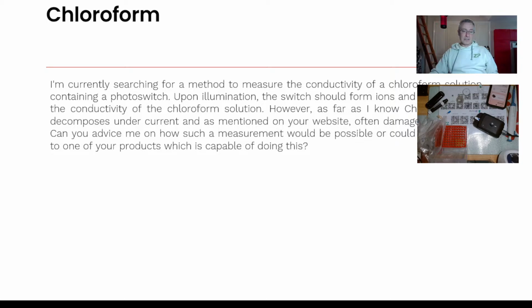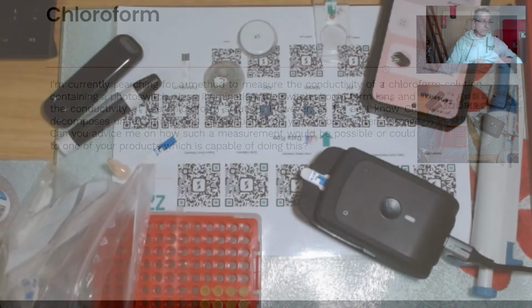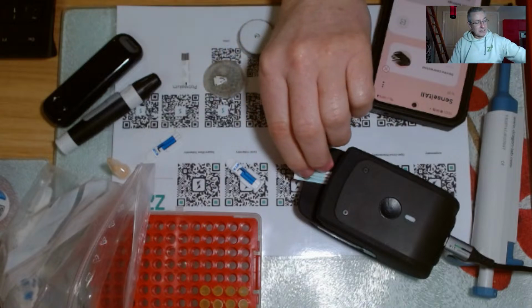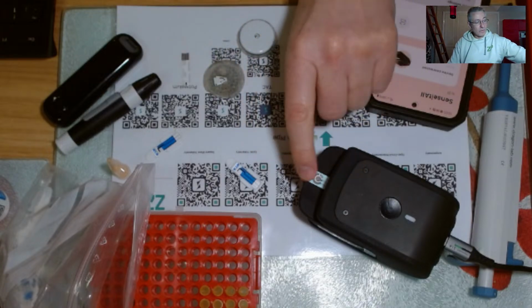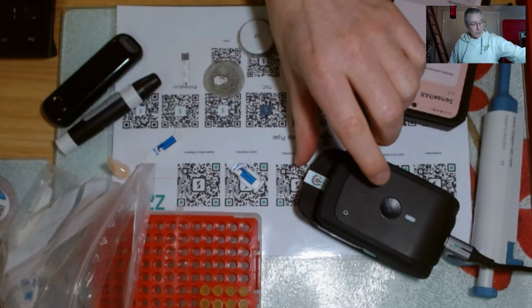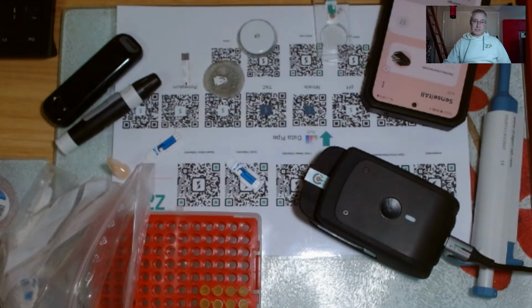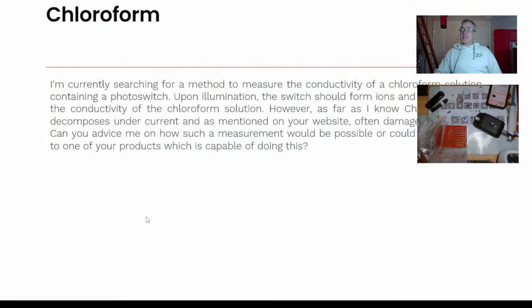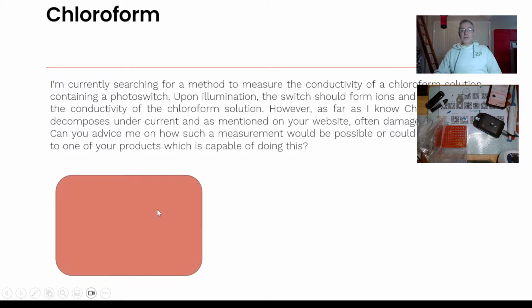And I just discovered, I should have realized this, but I didn't initially realize that, in fact, this potentiostat from ZP can actually take these solvent resistant screen printed electrodes, really no problem. I did test it just now and I was like, oh, okay, yeah, they actually do fit. Anyway, with that said, let's talk about the science.